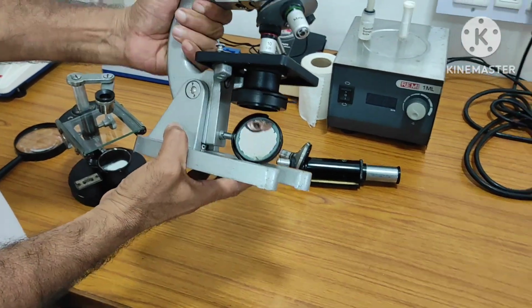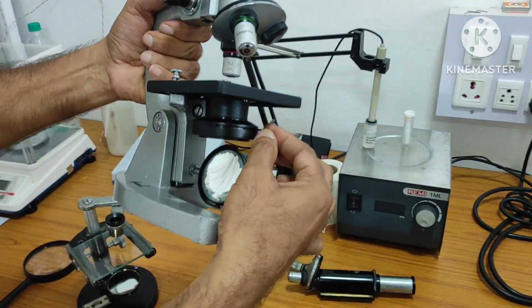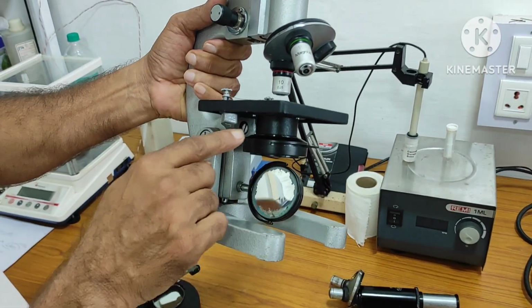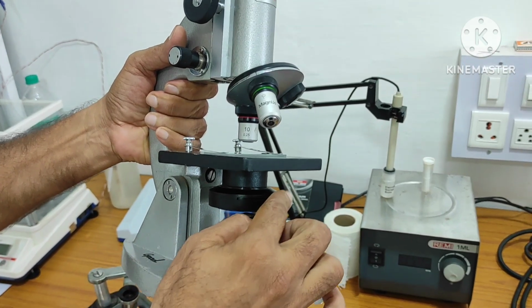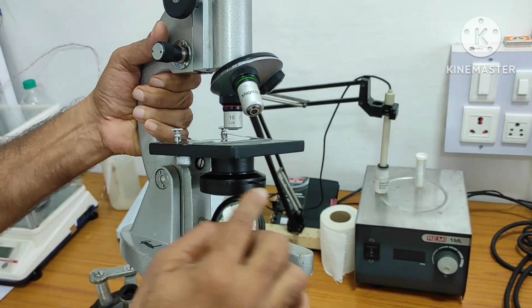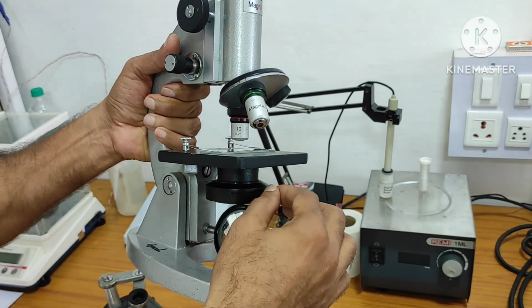Down you can see here, this is called as condenser, which allows the light, how much light should pass through the specimen. So this is called as condenser. Condenser is adjustable. So how much light is needed for better resolution, better magnification, better resolution basically, so that we can observe the specimen, right?